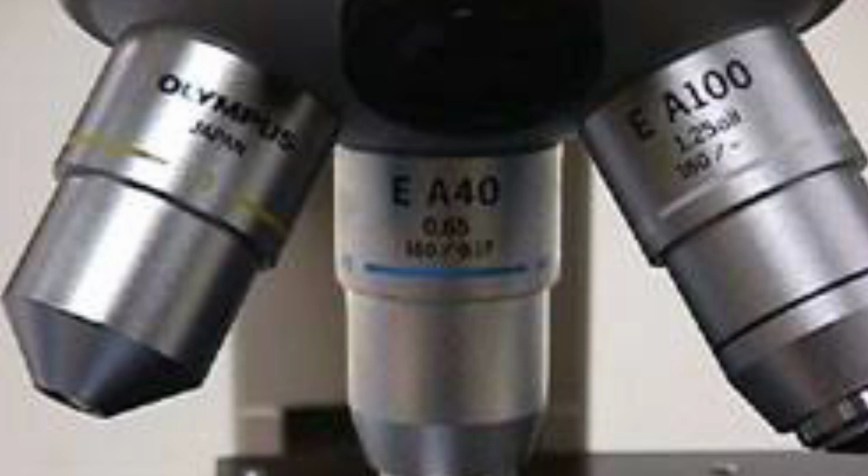Then the working distance. For the scanning objective lens, we have 17 to 20 mm. Low power objective lens, we have 4 to 8 mm. Then for the high power objective lens, we have 0.5 to 0.7 mm. Then for the oil immersion objective lens, we have 0.1 mm.